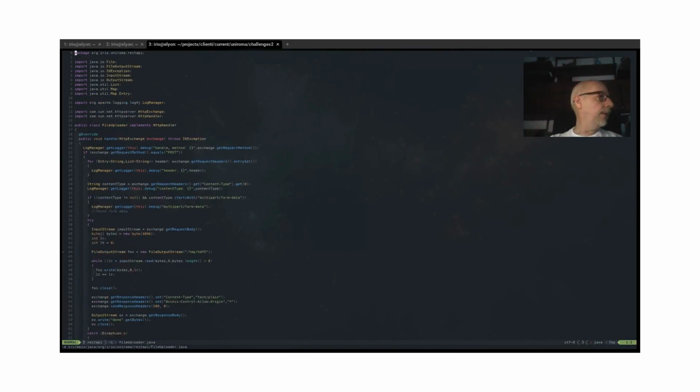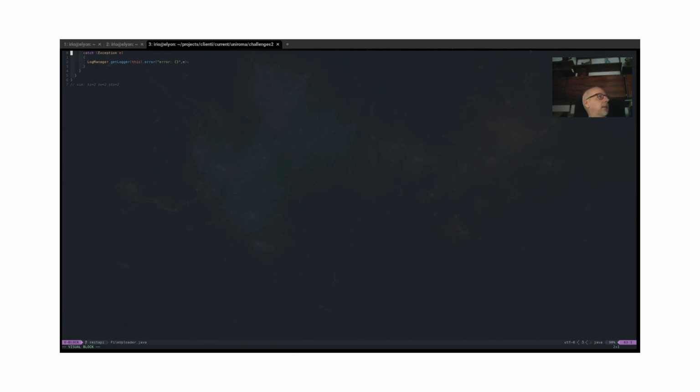Yes, it's implemented. Here it is. To the API and upload it to the HDF5 structure.